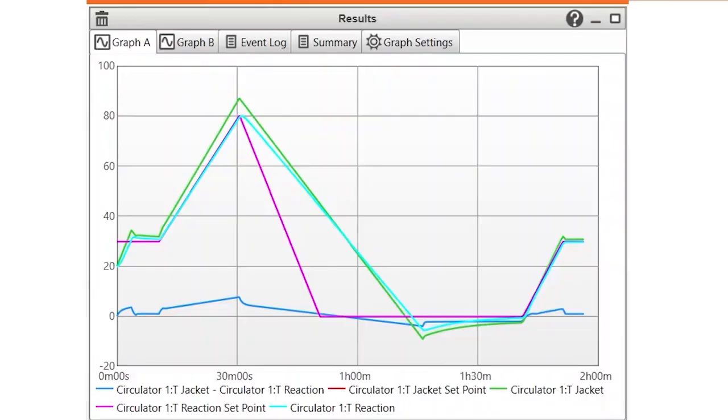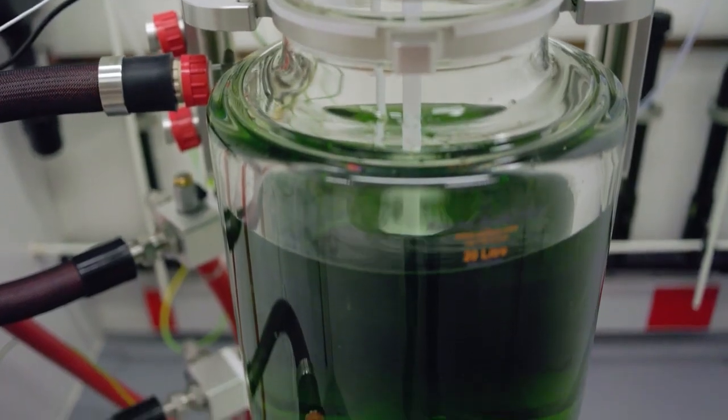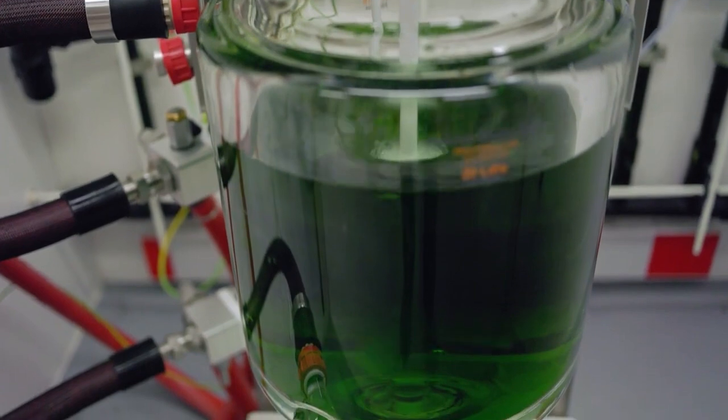What I quite like is looking at the heating and cooling rate, which should give me a rough estimate on exotherms and endotherms, which allows me to compare what I've been doing on the small scale to the larger scale, from round bottom flasks right the way up to the jacketed vessel, which might have a different shape of stirrer and just a different way of heating and cooling.